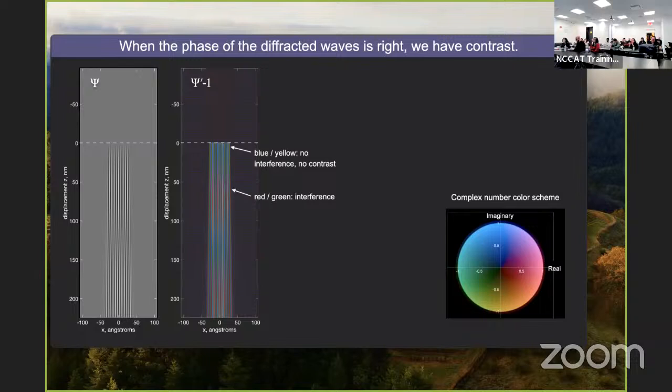Yes, I think that does help. Then just the other thing was trying to relate this to traditional light microscopes. So on light microscopes, we try to be at focus as much as possible. What would be that fundamental difference between light microscopes and electron microscopes to make the focus value different?